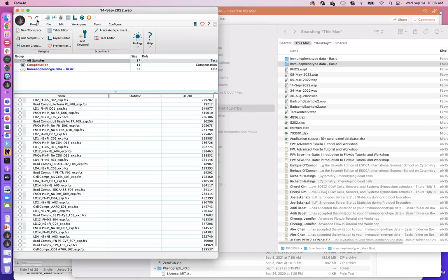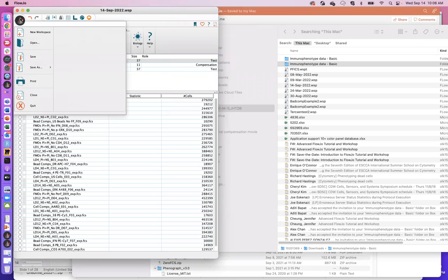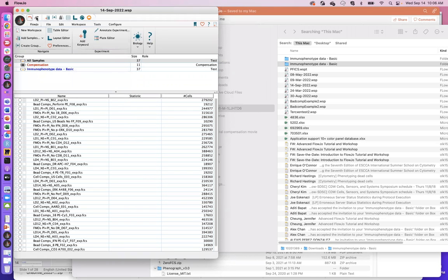All right, and then at the very top of the workspace, there are several functions that are quite useful. So the black ball here where the pyramid is inside has a lot of shortcuts, like opening a new workspace, right? Creating a new one, opening one that you had already saved, and of course, saving workspaces as well. You have the undo redo buttons right next to the black ball, and then at the very top here is the taskbar with some very important buttons like adding samples.